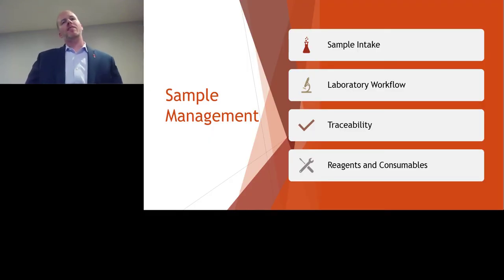So once you have your methods and your instrumentation up and running and everything is validated, you're ready to actually start the client-facing portion of the analytical testing. And this is really where it comes down to your sample management. How do you get samples? What is the workflow within your lab? The all-important traceability, and then your reagents and your consumables, and how those interplay within all of the levels of your sample management.